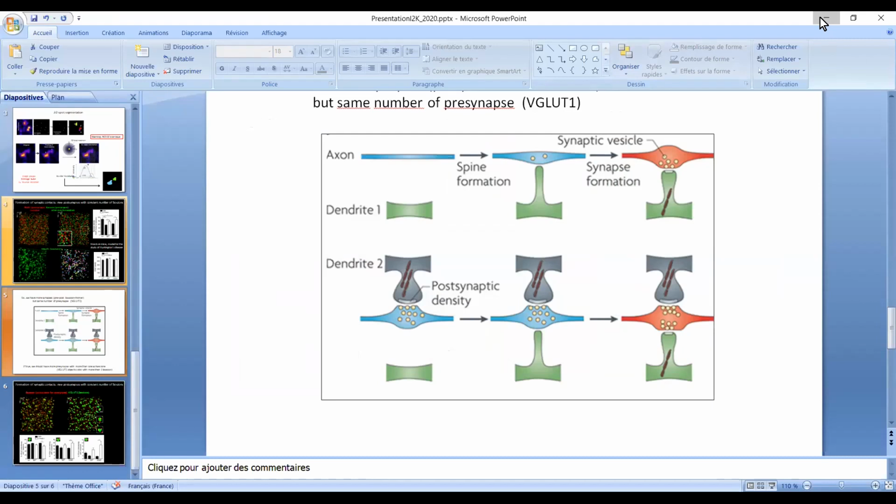So you have some images from the Dropbox. I don't know if you have those. Something called A or B with Viglut1, bassoon, and those things. It's in the data folder. It's called Neuro, and then you have C0, CM. But yeah, bassoon red. This is the one. Bassoon red and green. Which one do you want, Nicolas? In data, Neuro, I don't mind. I go into the same folder as you, so you find it. Well, we can take the first one.